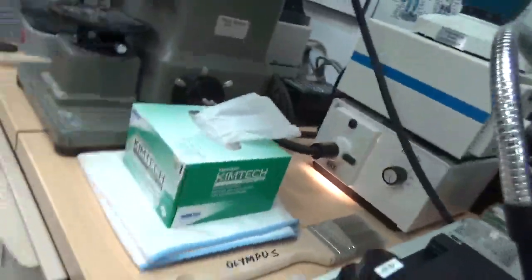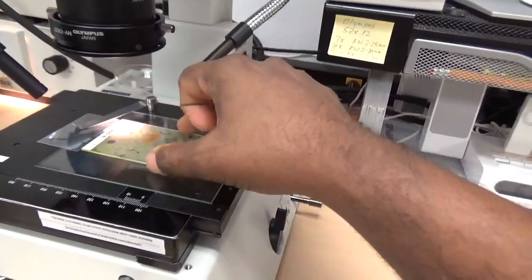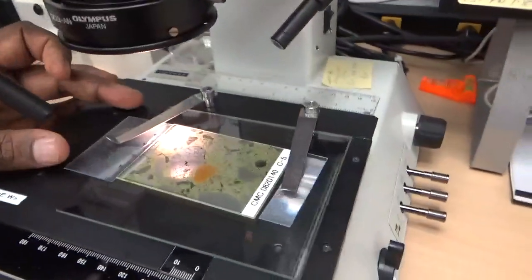Oops. Usually I make sure that my sample is clean, so no airborne fiber or anything shows up in the scan.